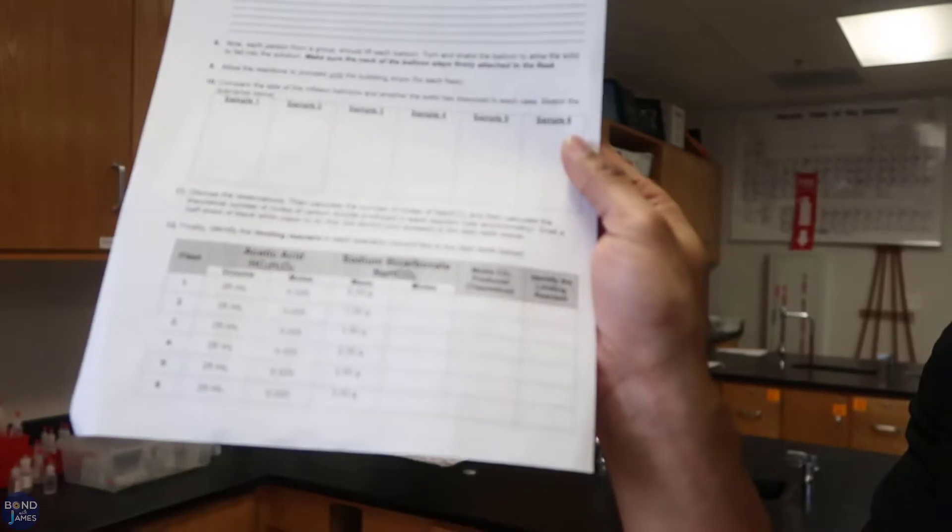I used this as an introduction to stoichiometry — it was an ABC activity, meaning activity before content. We did the lab first, they got some data, then we went into notes. We're going to come back and do the lab again once they've gotten the stoichiometry concept down. There was also a data table they didn't complete because they hadn't yet learned stoichiometry calculations, but now that they're learning that, they can come back and complete it on the first lab, and then we'll do it again with more information.